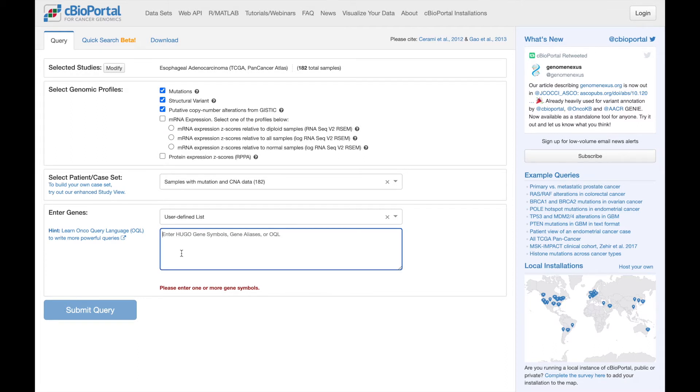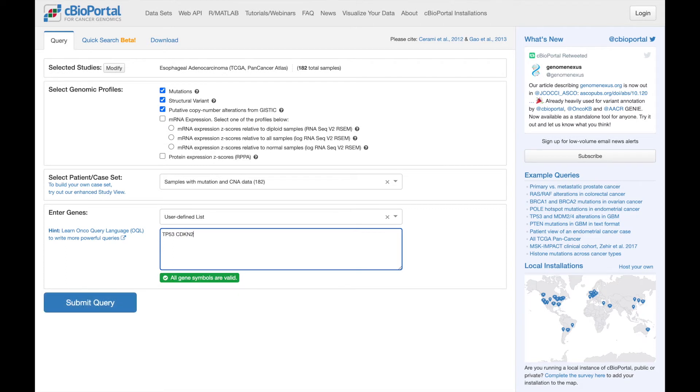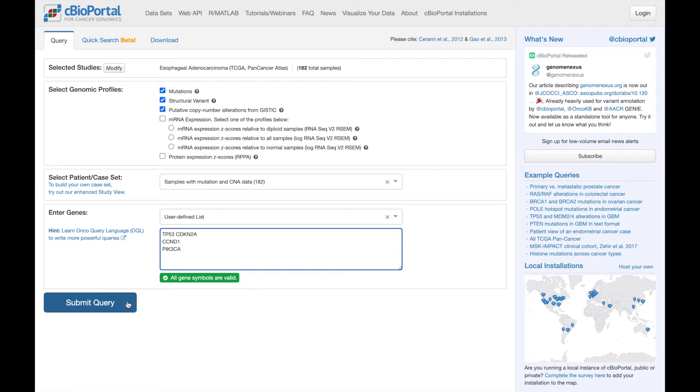Finally, we enter our genes of interest. Enter one or more genes separated by a space or on separate lines. And now we can submit our query.